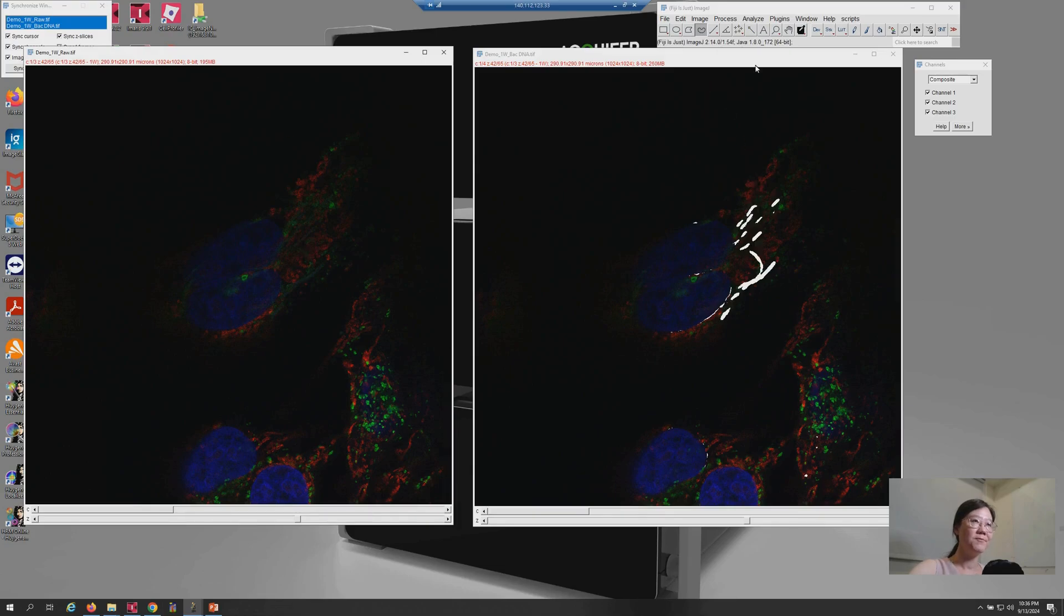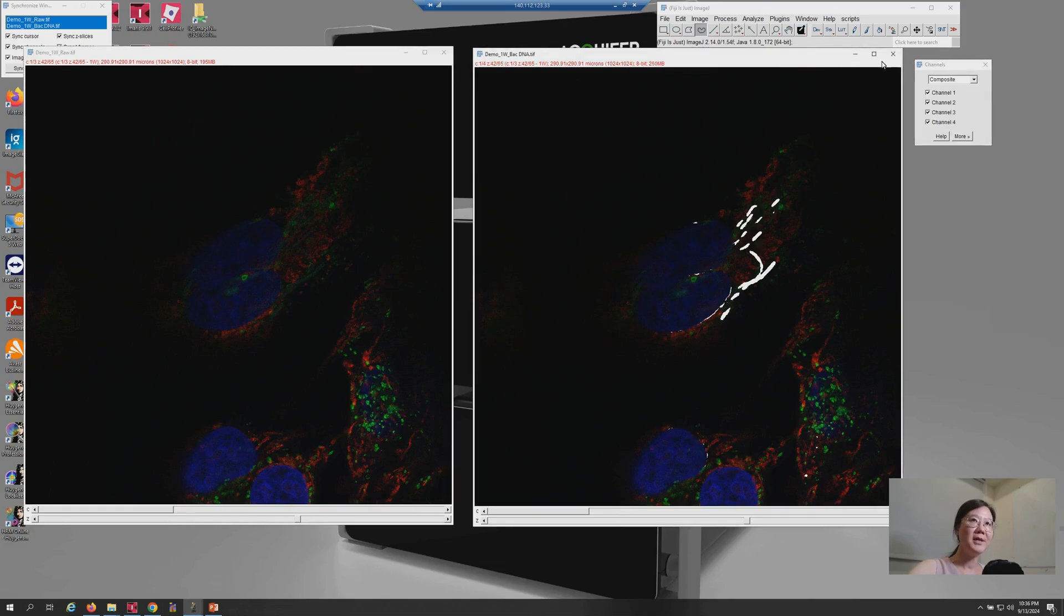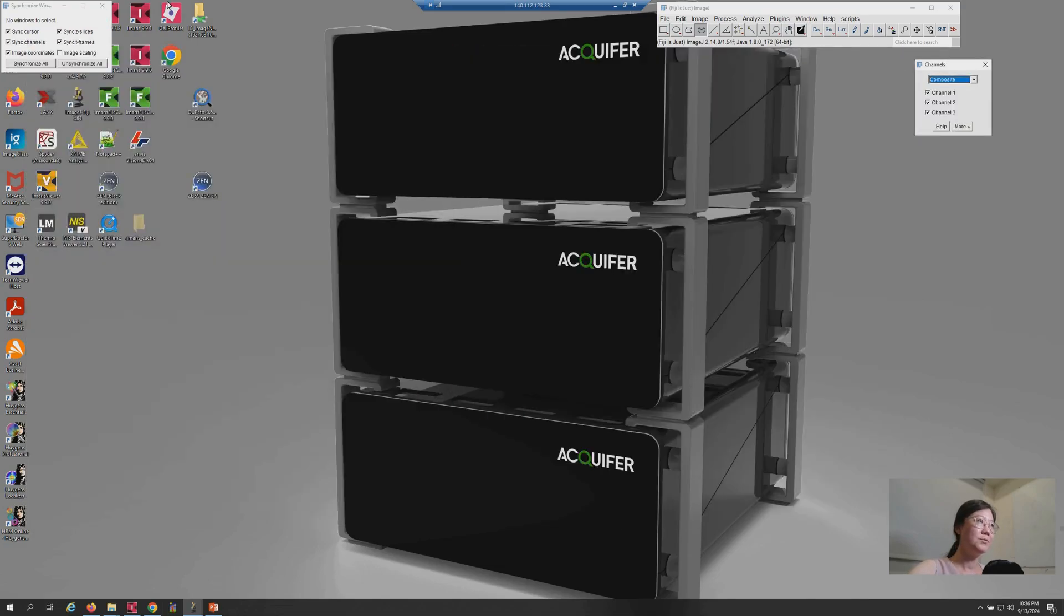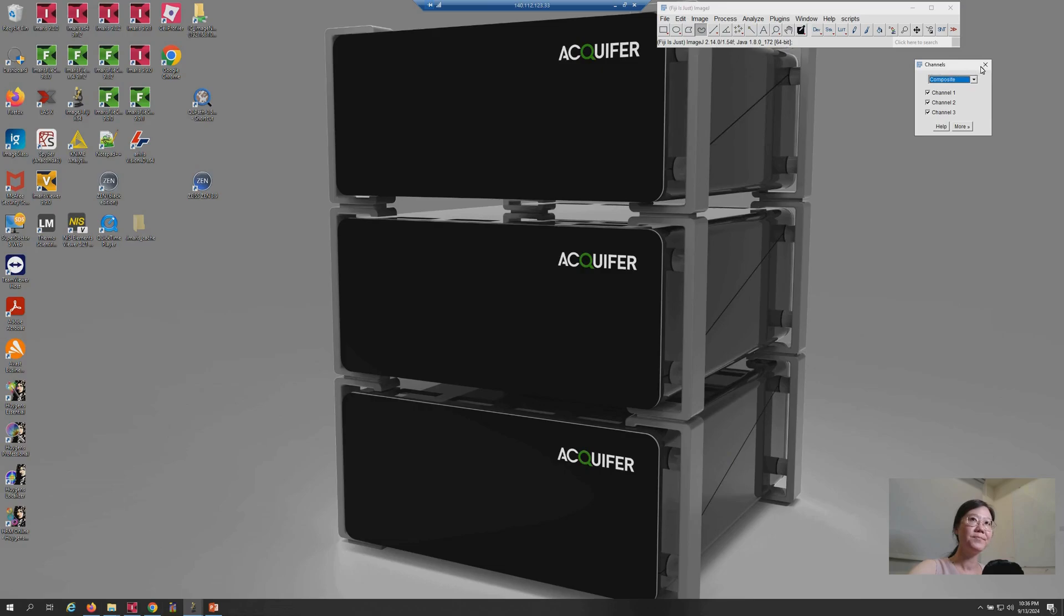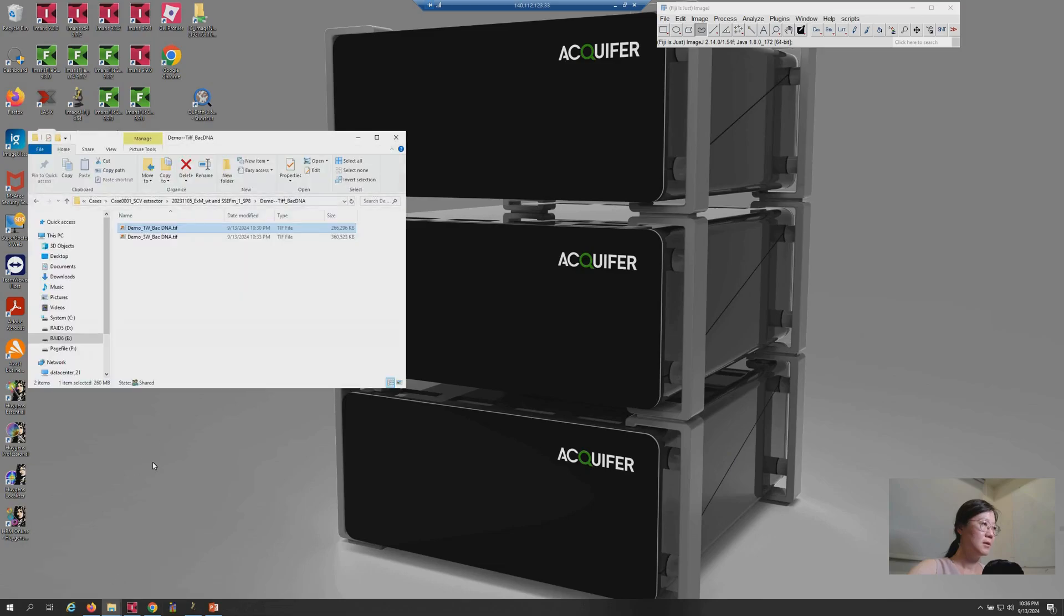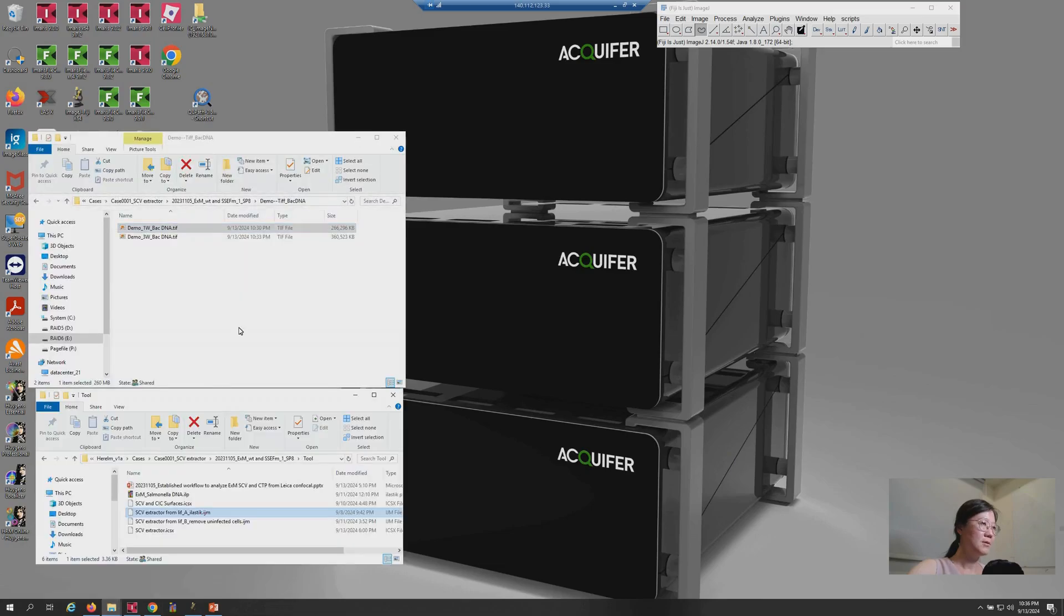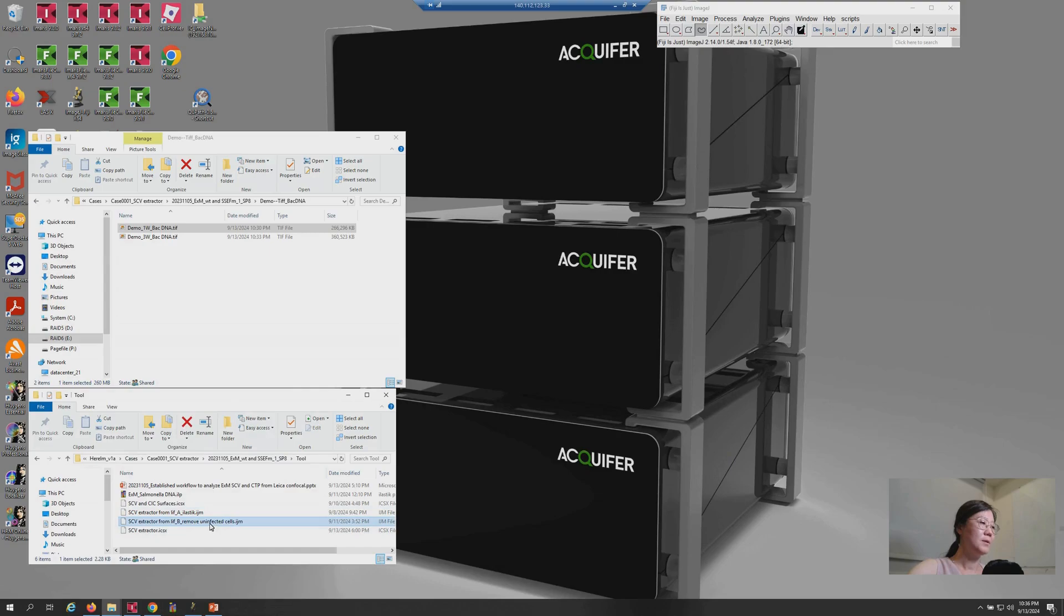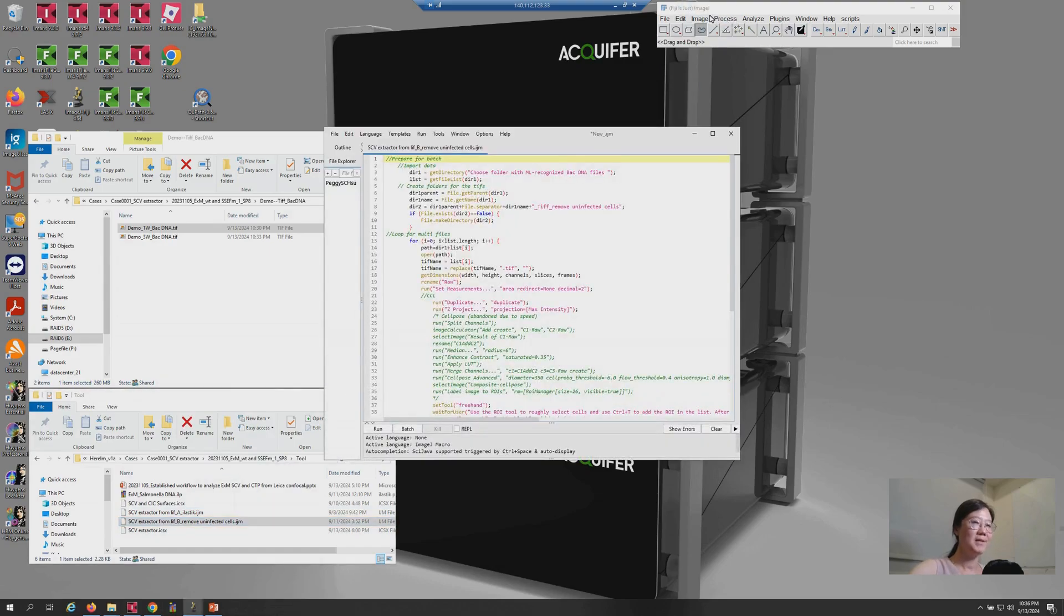Okay. So, that's the results from the first script, A. So, let me check and close those windows first. Then, let's use another script in order to remove the uninfected cells. So, please drag and drop the script B here.